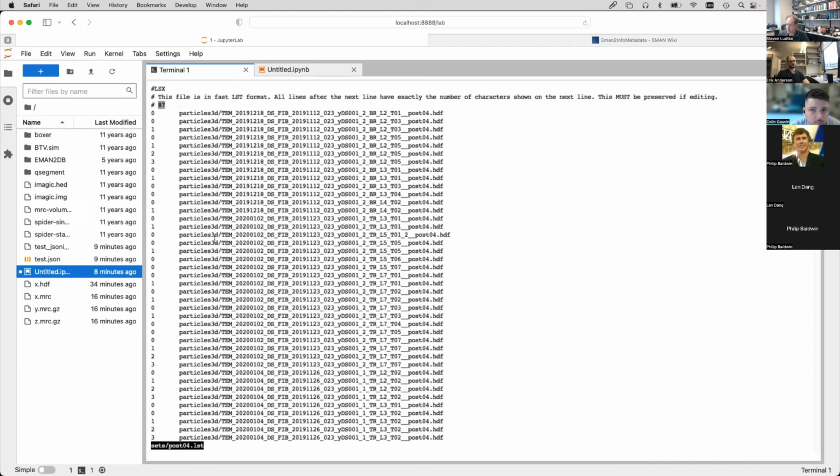And it's true, on a modern computer you could fit a 500,000 particle project, but you'd be eating up 500 megabytes of memory to hold that whole thing in memory. If you have several different variants, that's another 500 megabytes. It's just not a very efficient way of handling things. So we like to have a mechanism where we can keep the stuff on disk. If you have a project with 5 million particles, it'll also work with 5 million particles. So these LSX files provide a mechanism for that.